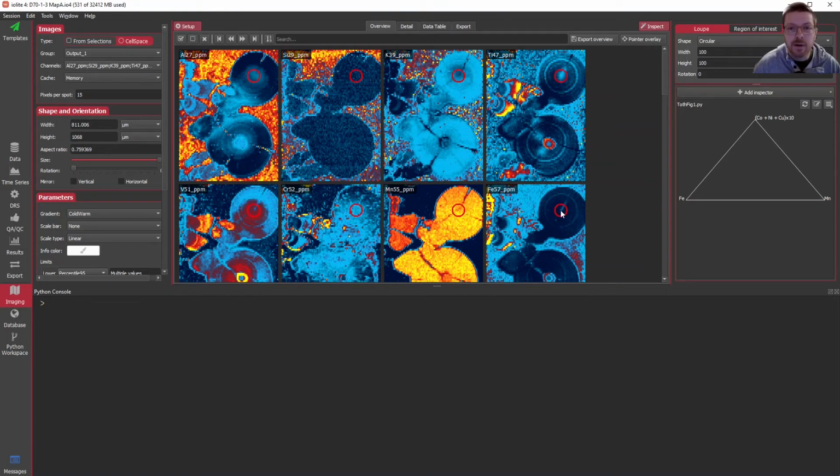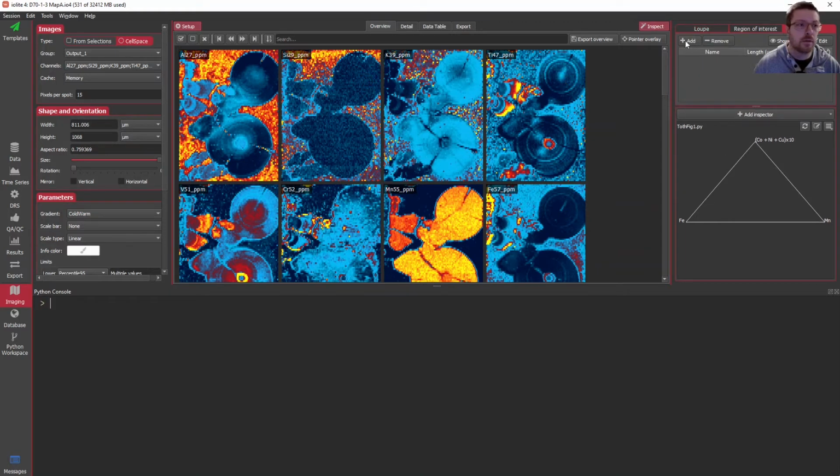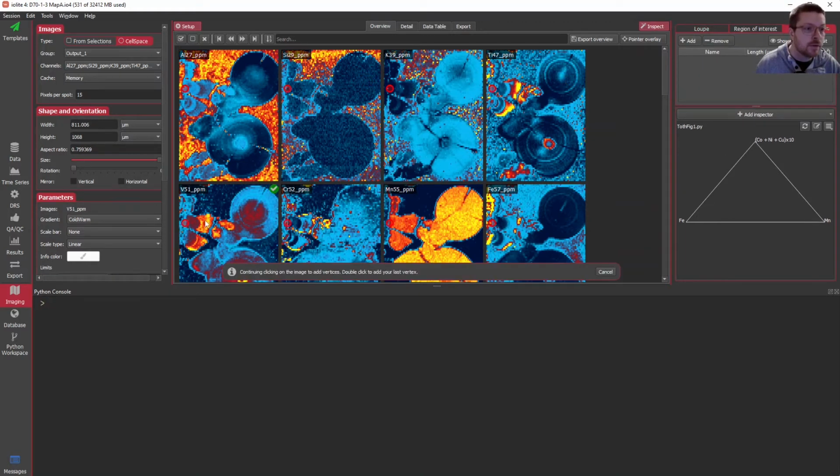Okay, so unfortunately the color for that ROI isn't very good. So I don't know if this will come through, but there is a data point plotting right down there. Let me see what happens if I create a profile through here.